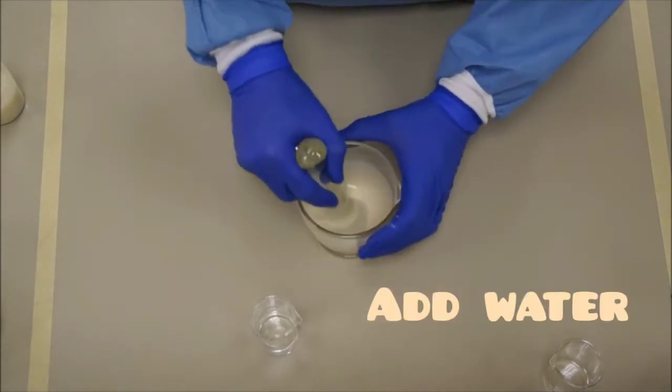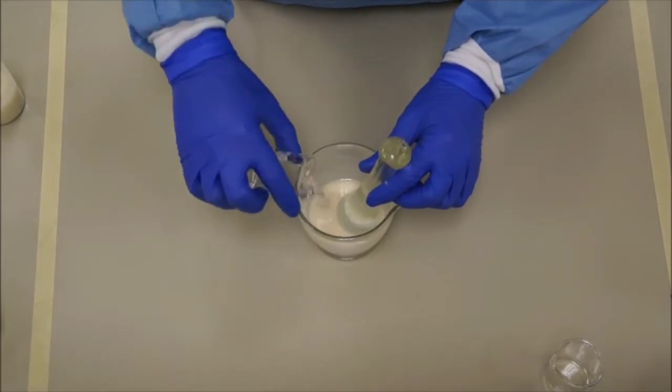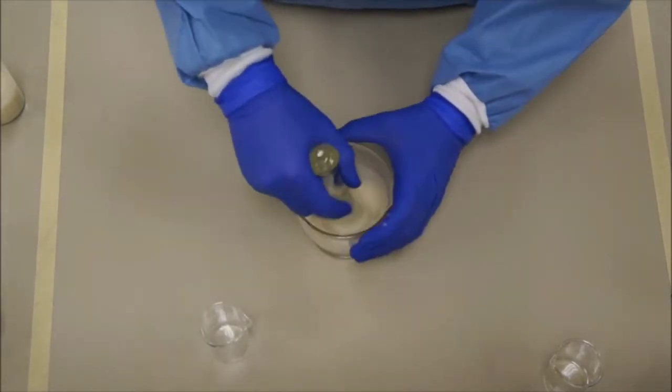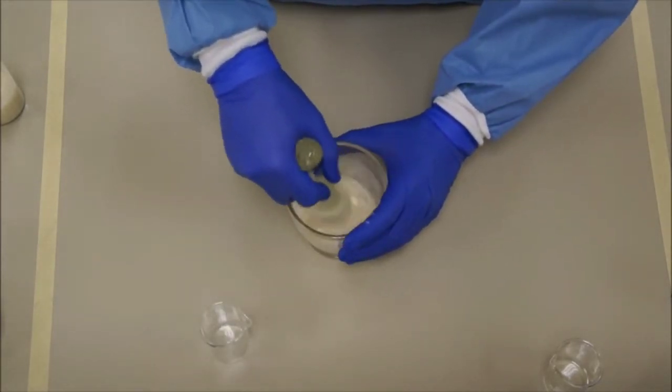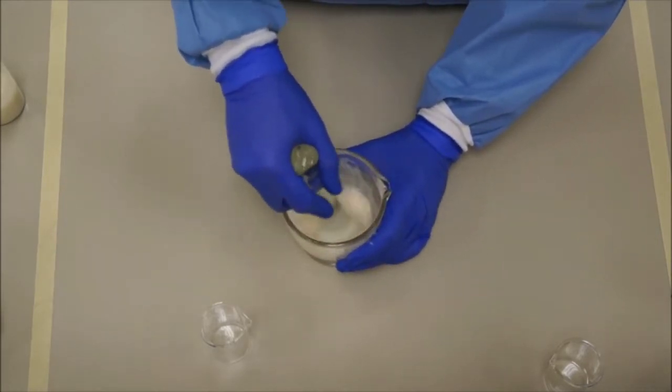Now at last you have to add water and triturate to produce a primary emulsion. After adding the water, continue the process of trituration until a nice smooth-textured paste is formed.